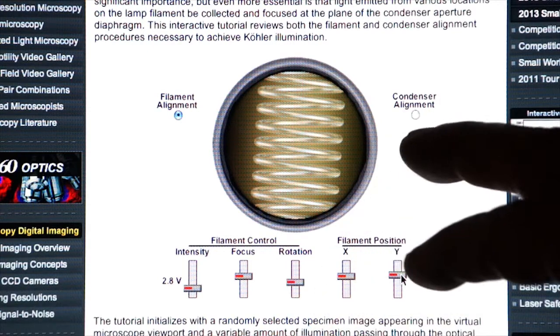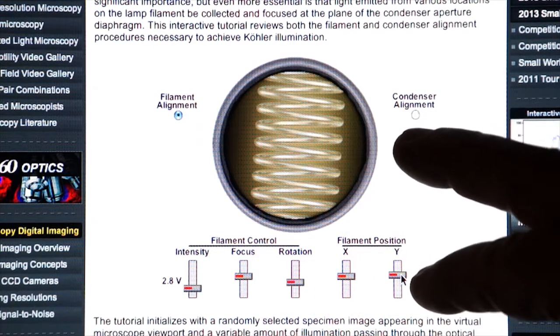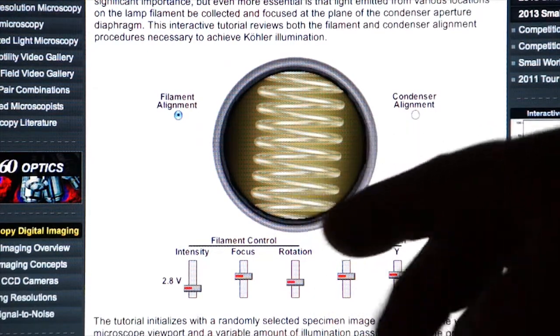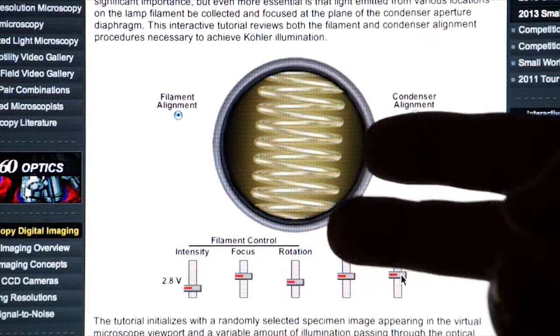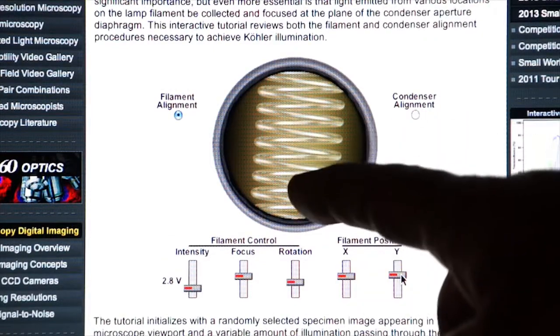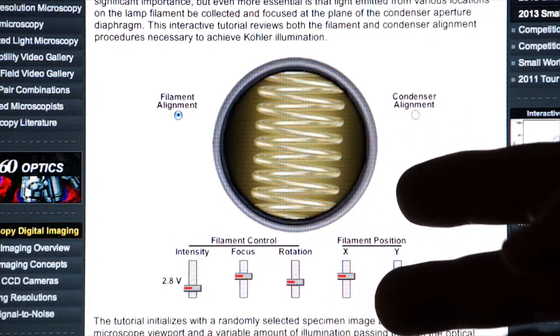Again, you shouldn't have to do this with modern microscopes because the bulbs are pre-aligned. But it gives you an idea of how important the lamp is to the illumination of the microscope.